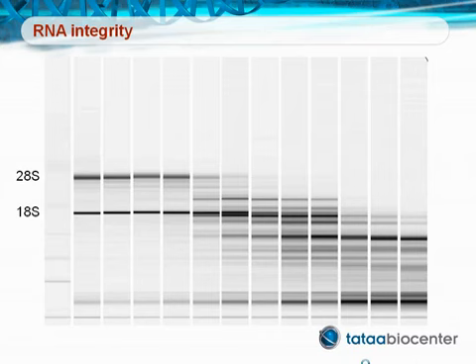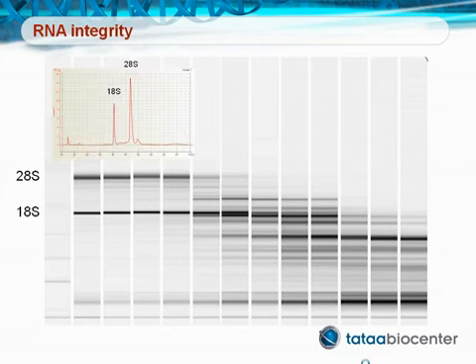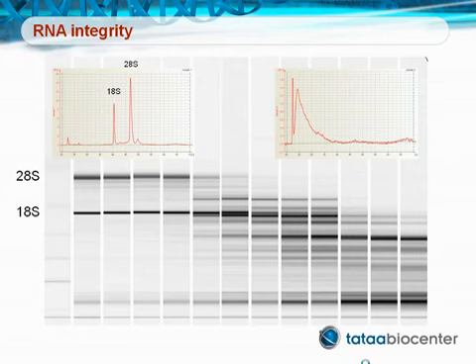One way to check the integrity of the RNA is to separate the RNA in the sample by size. This can, for example, be done on the Experion system from Bio-Rad or the Bioanalyzer or TapeStation from Agilent Technologies. What you will see is mainly bands from 18S and 28S ribosomal RNA. In a high-quality RNA, you have two sharp bands or two sharp peaks in the electropherogram, reflecting intact 18S and 28S ribosomal RNA. Degradation fragments the ribosomal RNAs, giving rise to high mobility fragments that appear as a smear on the gel and a broad, fast migrating peak in the electropherogram.